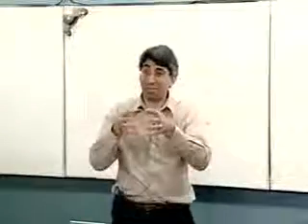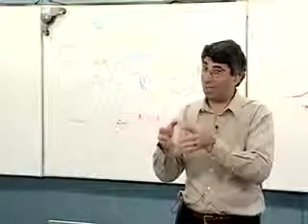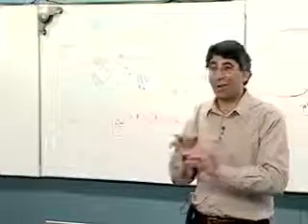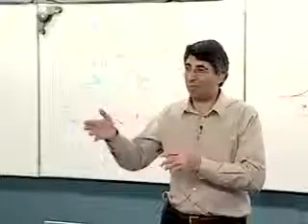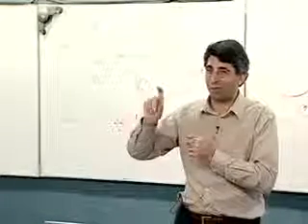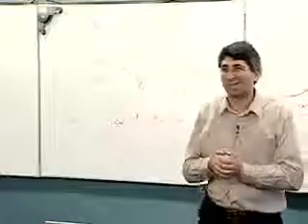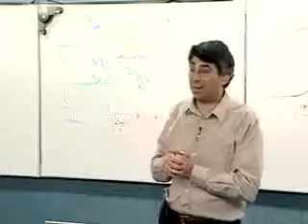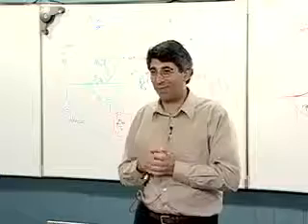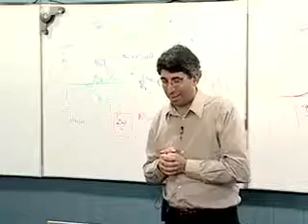Next, in your electrochemical cell, even if you have short wires and whatnot, it is quite possible to develop high resistance by some obvious things like forgetting to put in the supporting electrolyte, having a frit in between your reference and your working electrode. If you're going to use a two-compartment cell with a frit in it, make sure the reference electrode and the working electrode are in the same compartment. The counter electrode should be in a separate compartment, right? But you don't want excessive resistance. You want high resistance, but not excessive, because that extra frit is an uncompensated resistance. The frit that's associated with the reference electrode is a compensated resistance. Okay, so you need that in there.